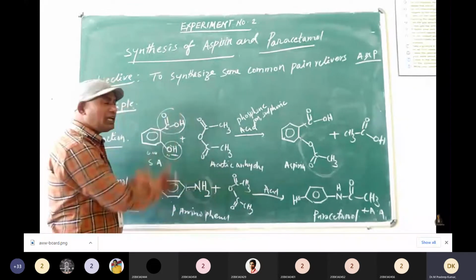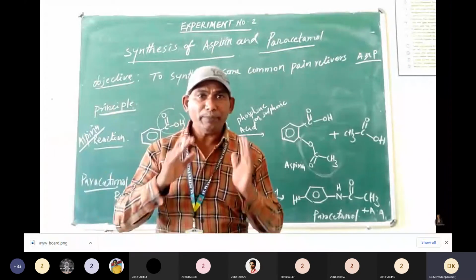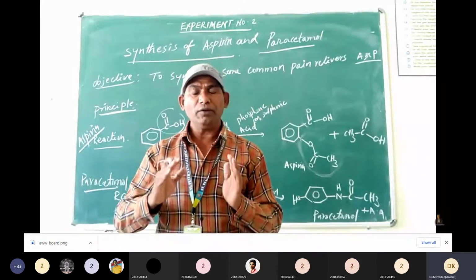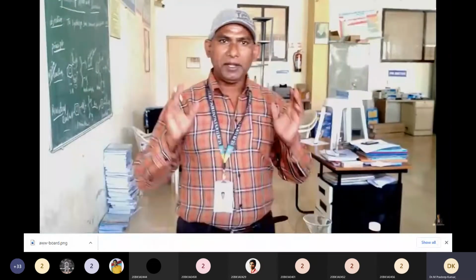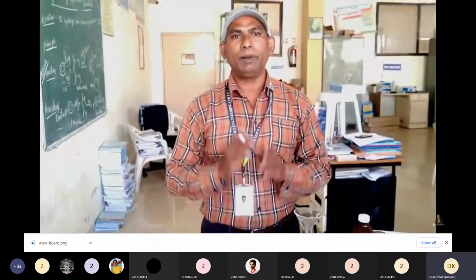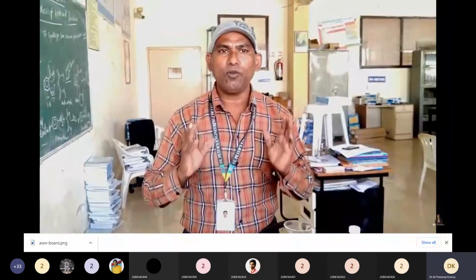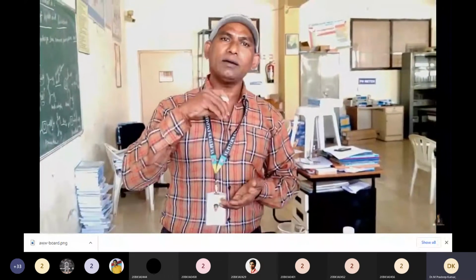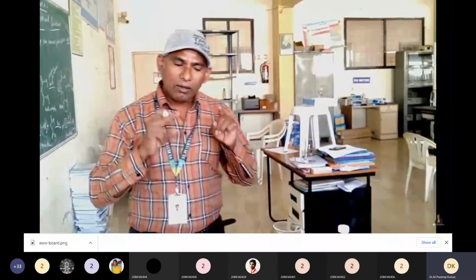Okay, this is about the final reaction. The demonstrator will now prepare the compound. First, we look at the procedure for the preparation of the compound: what chemicals are present, what apparatus is needed, and what is the procedure. Let's look at the apparatus.